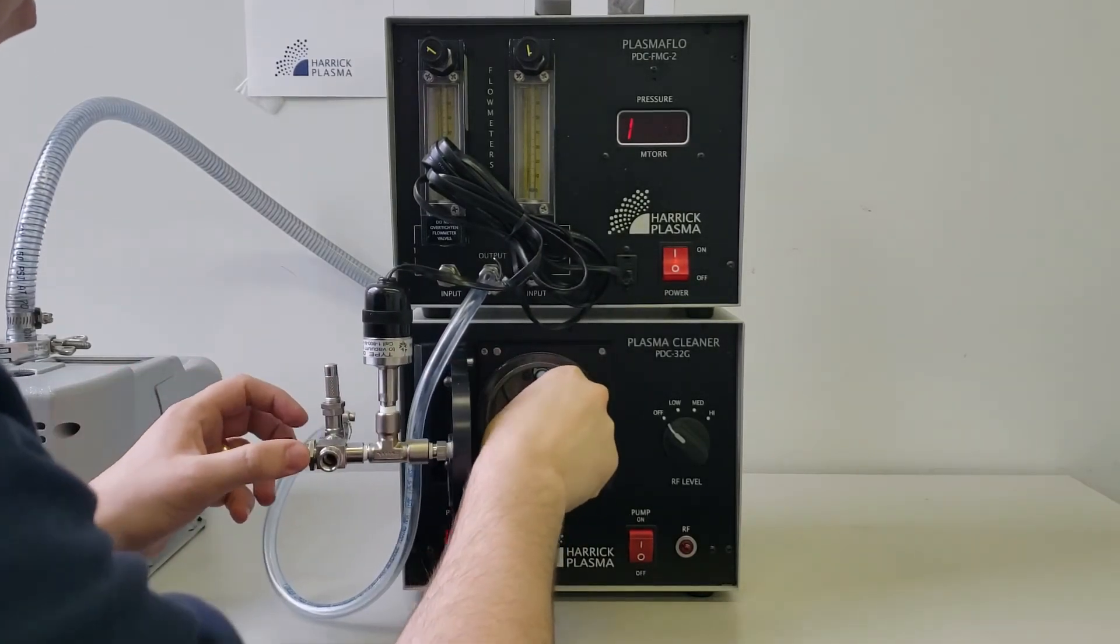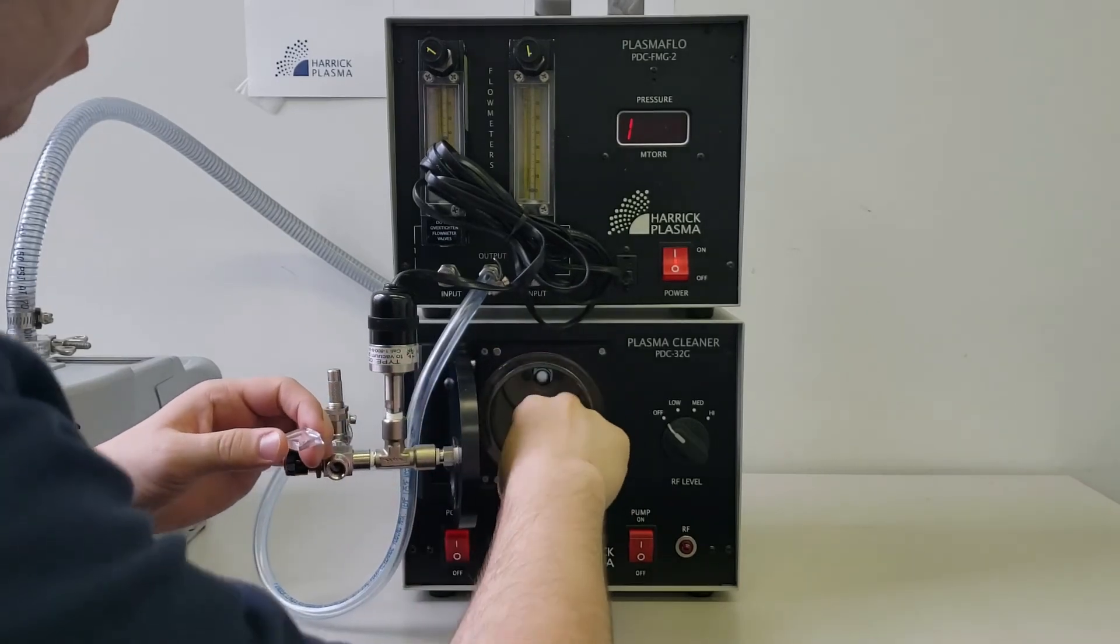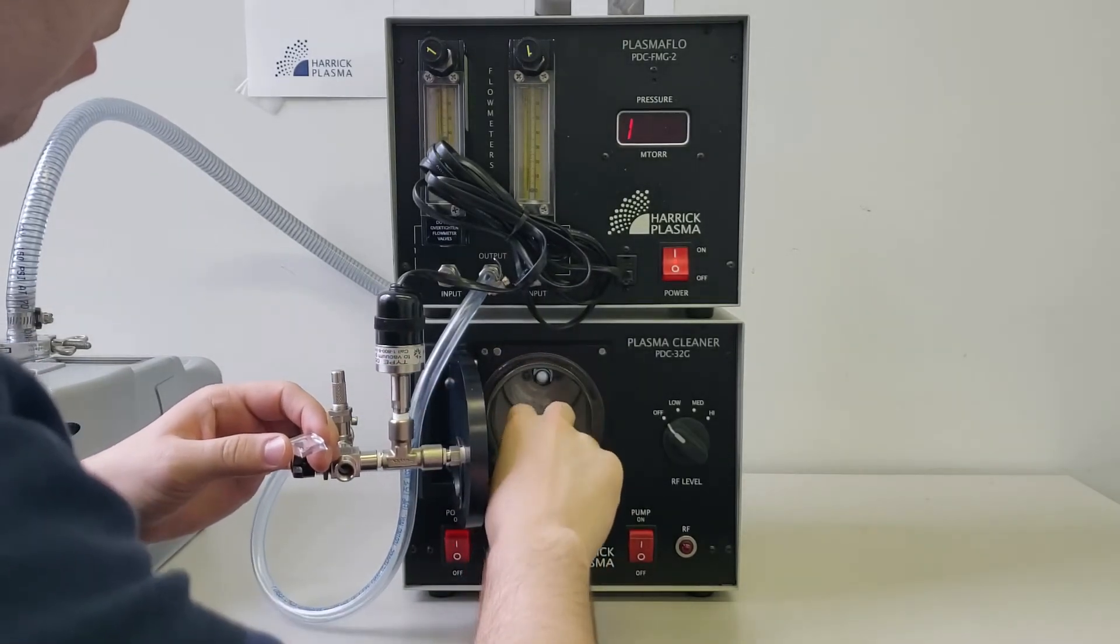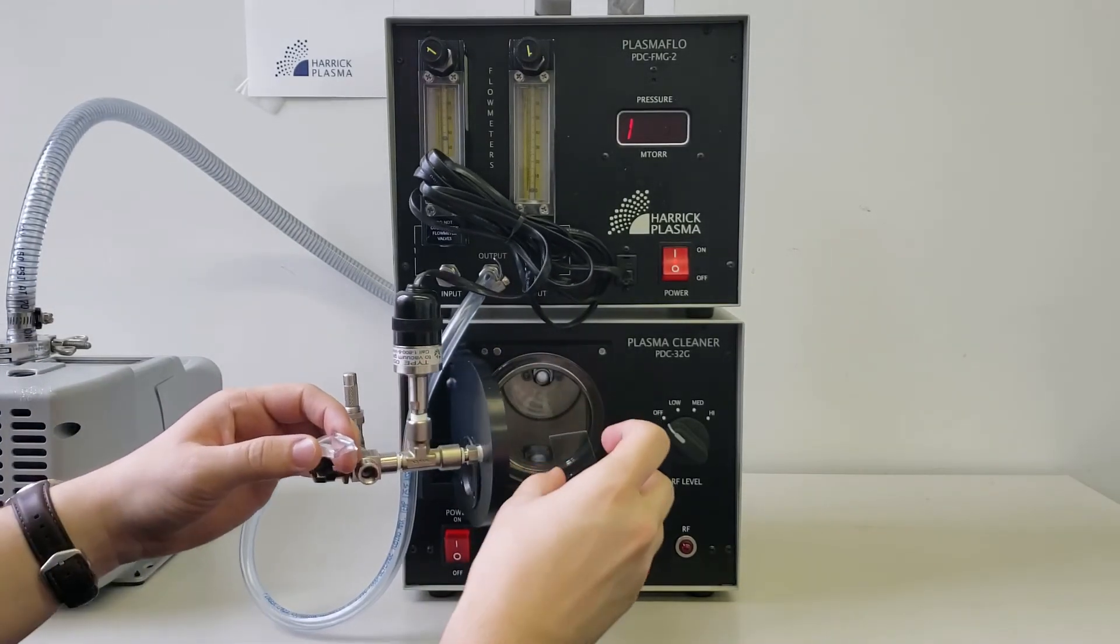When removing the PDMS from the plasma cleaner, do not touch the surfaces to be bonded. This can transfer particulates or oil that can block covalent bonds from forming.